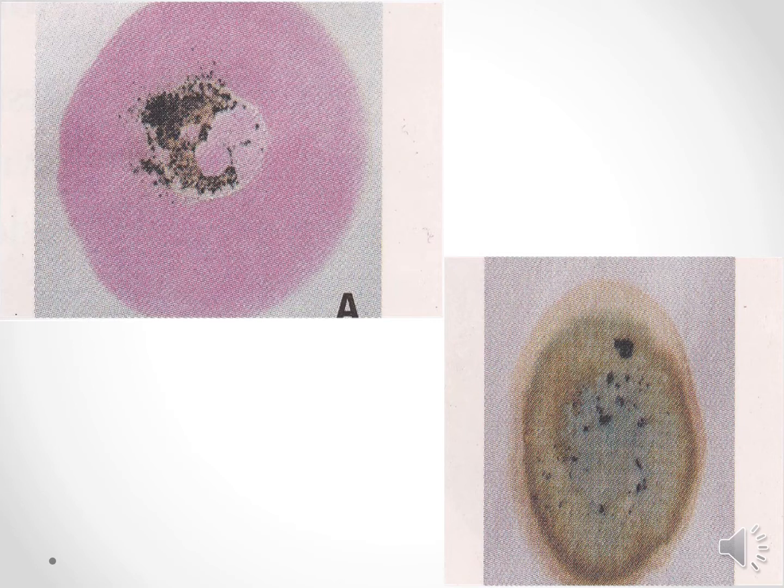Guaiacum begins with the G letter. For remembering, phenolphthalein is pink in color, and guaiacum begins with G, so the color is green. It's only for remembering.